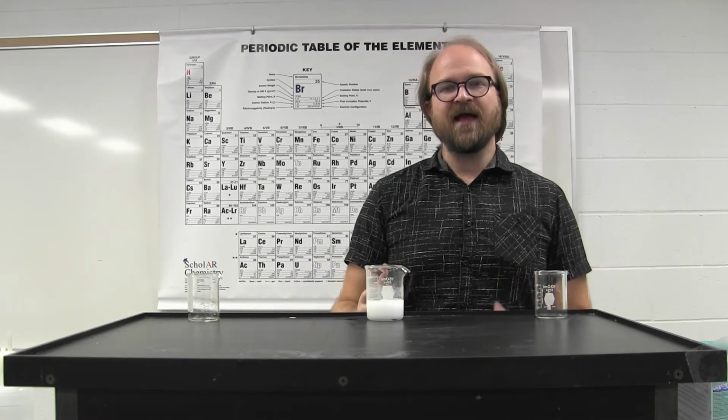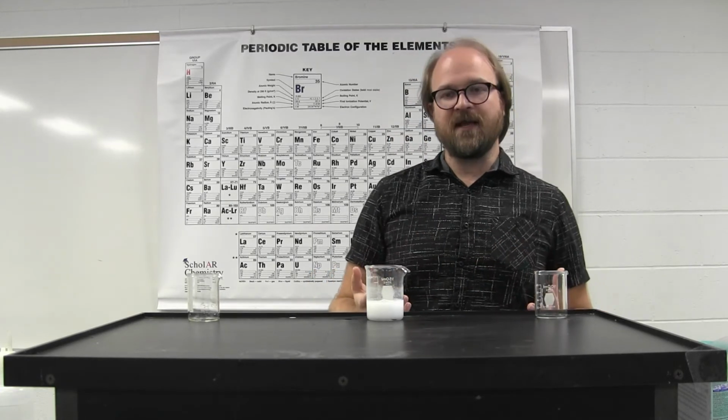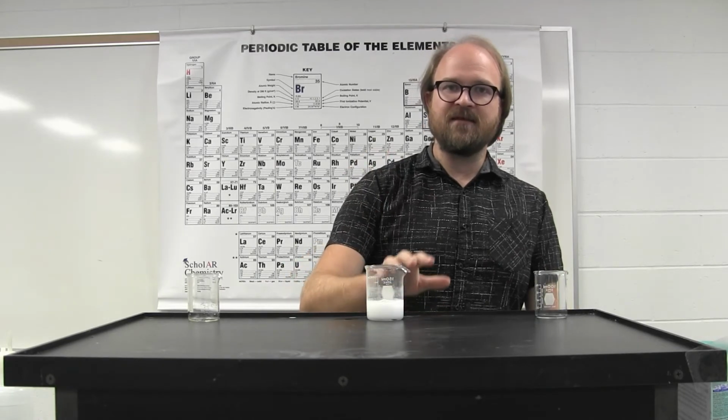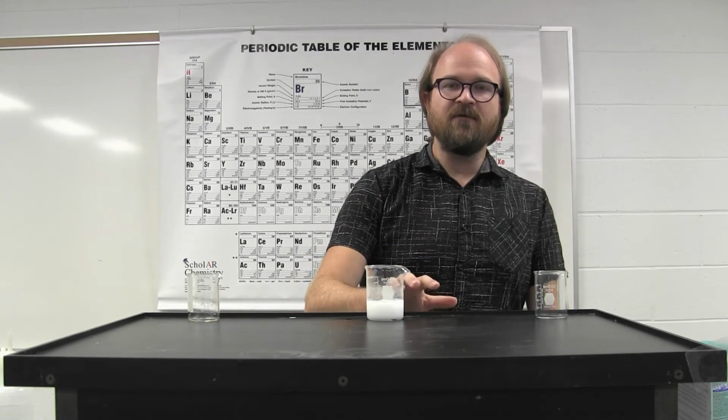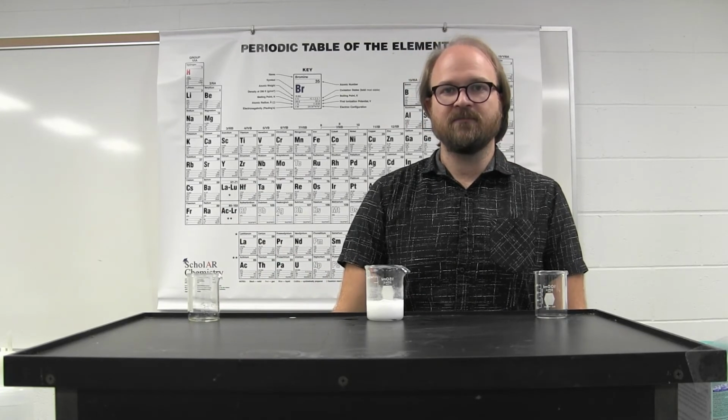In part B, you're looking at a few different precipitation reactions, and you're going to be separating the precipitate, the solid material, from the liquid material using filter paper.